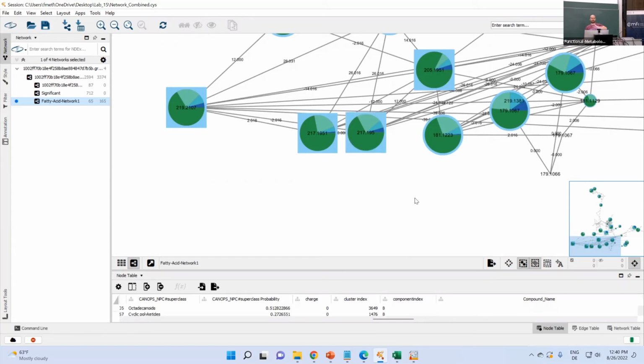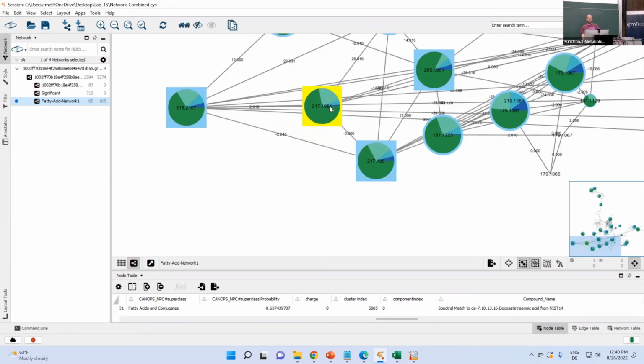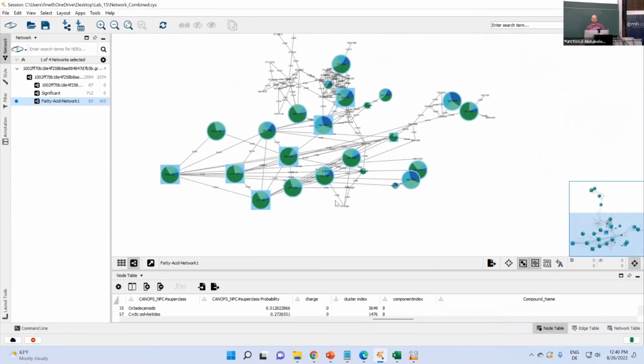But for now, let's assume I go to the dashboard and they're truly 2 individual peaks, and that's a real thing. And maybe I also know that by chemical context this is a high fatty acid containing Synechococcus culture, and I want to showcase this as one of the results in my paper. Then of course I want to get this out into a figure, right? And Allegra showed you the, in our opinion, go-to tool, which would be a vector graphic program to further manipulate that. But before I do that, I would try to already get this ready so that I don't have to do much manipulation downstream.